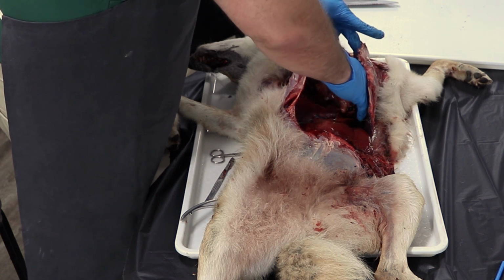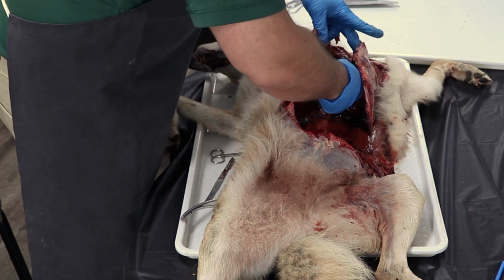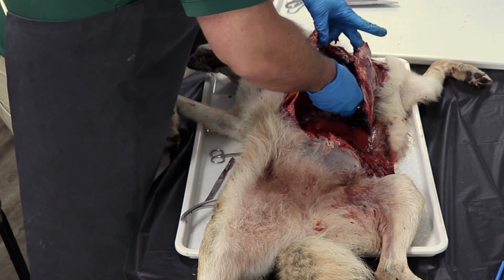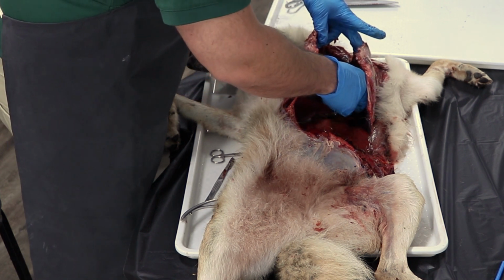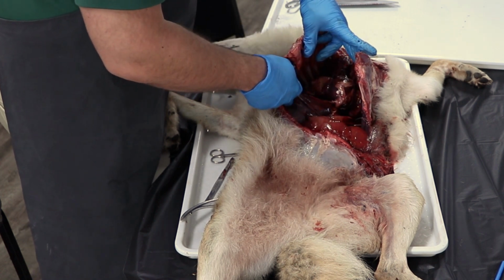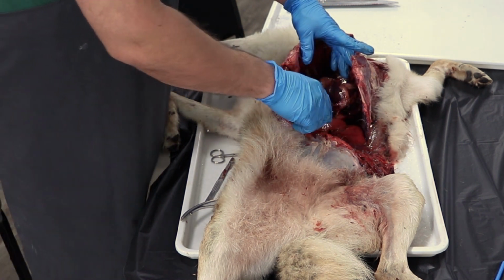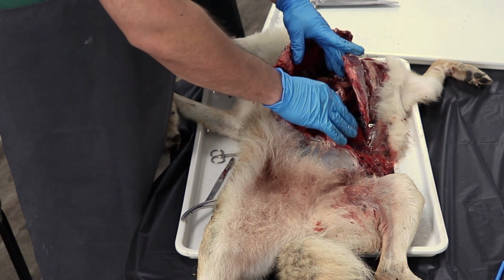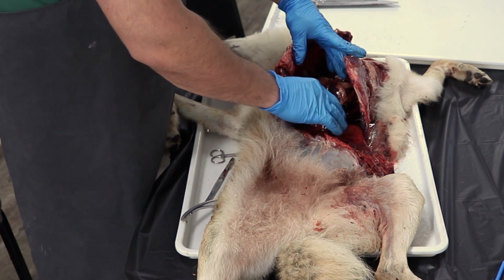Here's an atrium on one side, atrium on the other. And we have a divided ventricle. That's the large fleshy part at the posterior portion of the heart down here. So here are your major thoracic cavity organs. And as we go past this diaphragm we've cut, we find the largest internal organ in the mammal body, and that is the liver, which performs the same function for the coyote that it does for the snake.